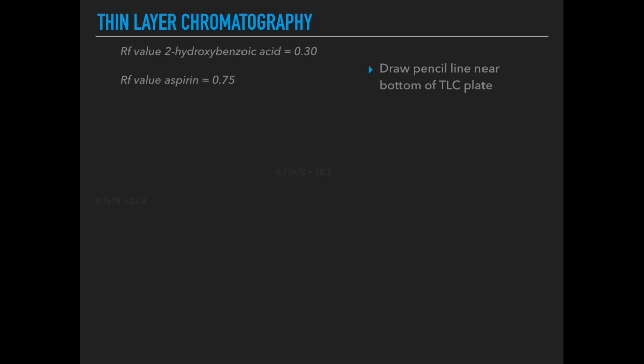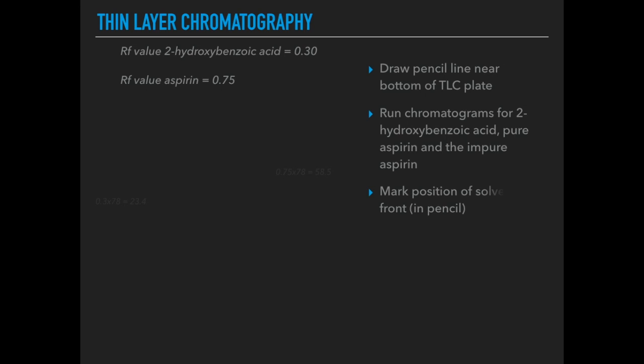The student first draws a pencil line near the bottom of their TLC plate. They then run three chromatograms: one for 2-hydroxybenzoic acid, one for pure aspirin, and a third for the impure aspirin they've made. They mark the position the solvent reaches in pencil — that's called the solvent front. Then they compare the positions, or RF values, of the spots for the impure aspirin with those of the two pure substances.